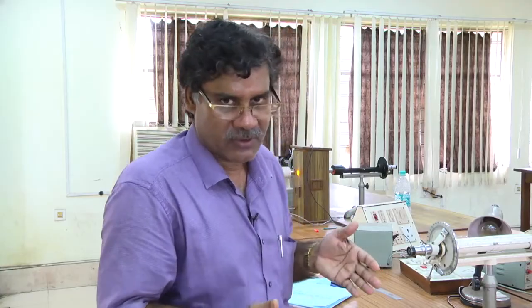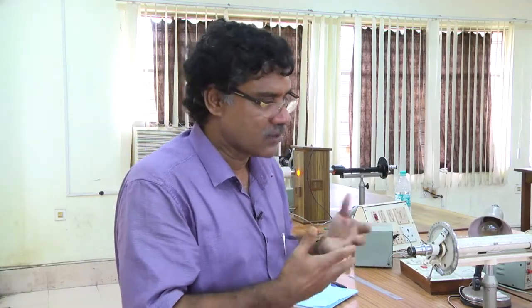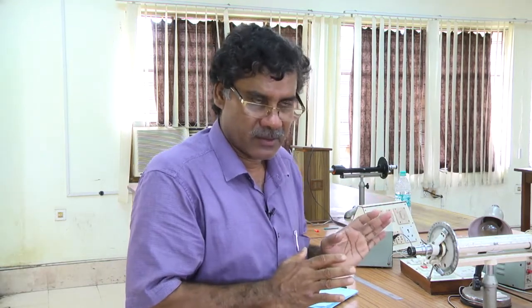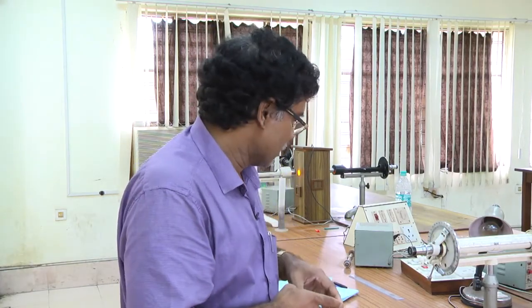Also for preparing solutions, one has to learn how to get lower concentrations of solution from higher concentrations, and that I also described. I think this is a simple experiment, but it is a very nice experiment to find out the specific rotation as well as the concentration of an unknown solution. Okay. So, I think I will stop here. Thank you.